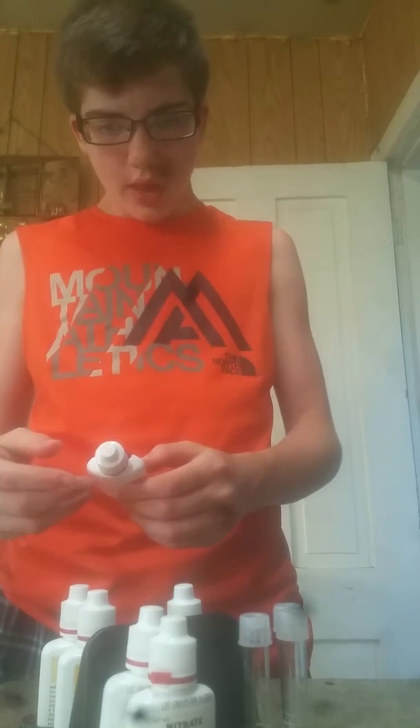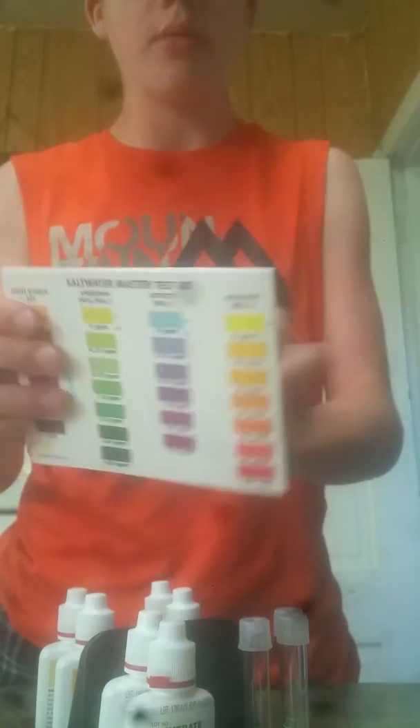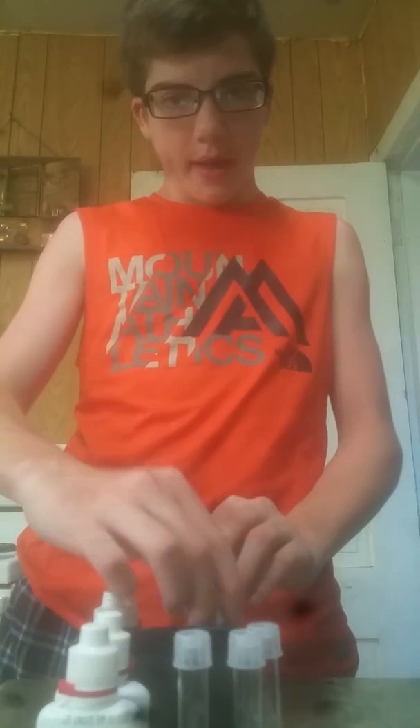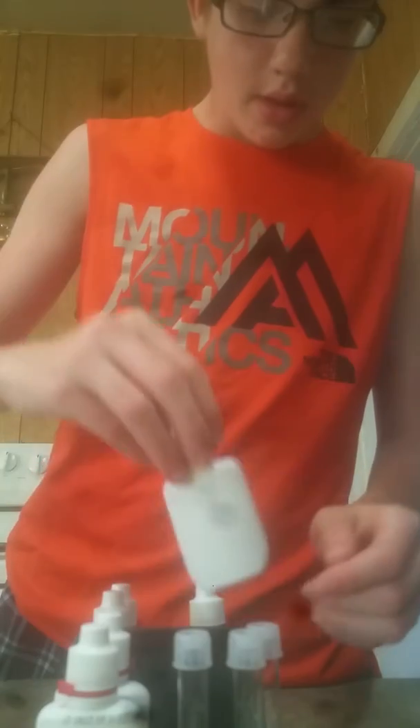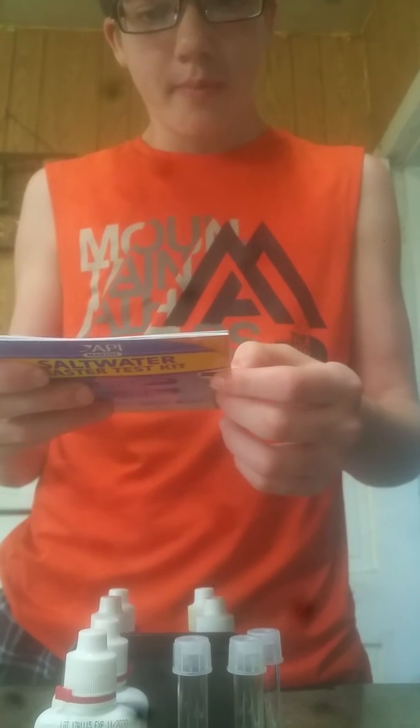For the nitrite, that uses one bottle. It should be blue, maybe turning into a little bit of violet — but you really don't want to have any of those in your tank. For the high range pH, you're going to want between a really light reddish purple or like a magenta. That's all you want for the pH.